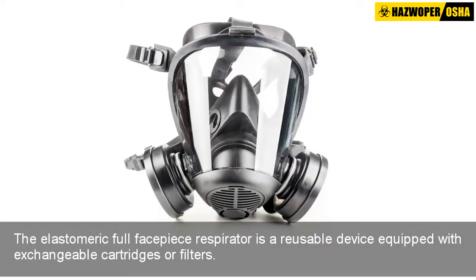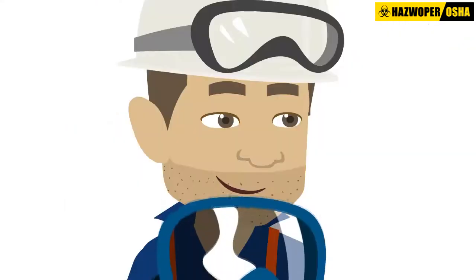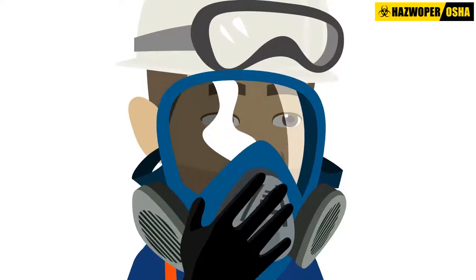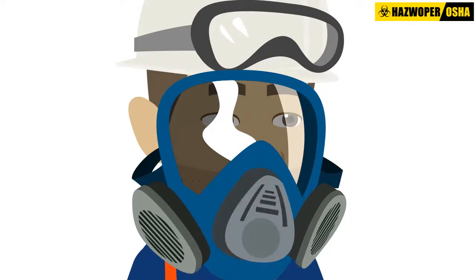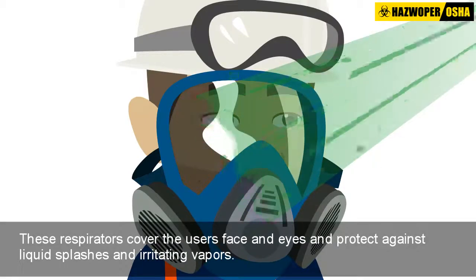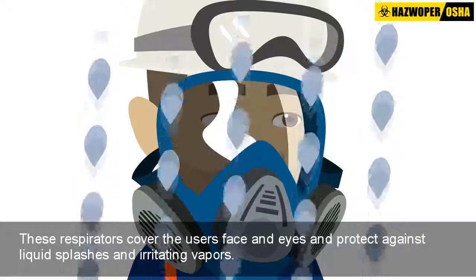Like the elastomeric half facepiece respirator, the elastomeric full facepiece respirator is a reusable device equipped with exchangeable cartridges or filters. It is also made of rubber or silicone, but the elastomeric full facepiece has a clear plastic lens that covers the face and eyes, roughly from the hairline to below the chin.